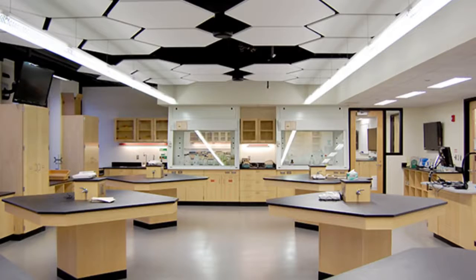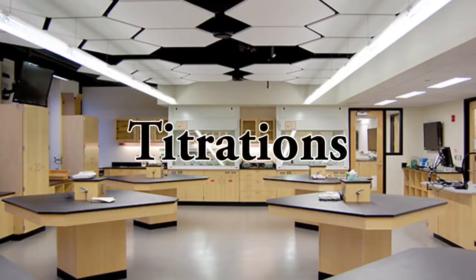Welcome to the UNL Chemistry Department. In today's video, we are going to be looking at the proper technique and procedure for titrations.